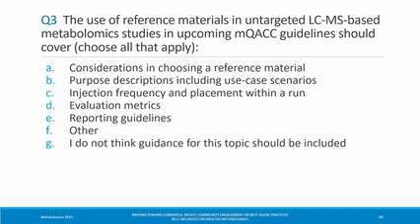So we're using reference materials, and you want to know about considerations in choosing a reference material. Why do we use a reference material, and how do we use a reference material? When should we inject it? How should we evaluate it? And let's report it, please.